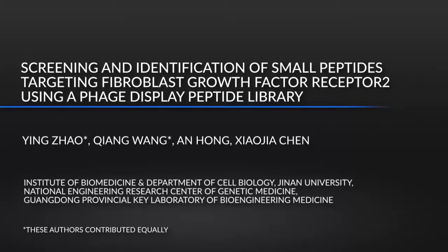Compared with other methods, this protocol makes it easier to find new antagonists, agonists, and allosteric modulators quantitatively and qualitatively, without knowing the high-resolution structural information of the target protein. This protocol is highly efficient, easy to handle, economical, and commercially available.